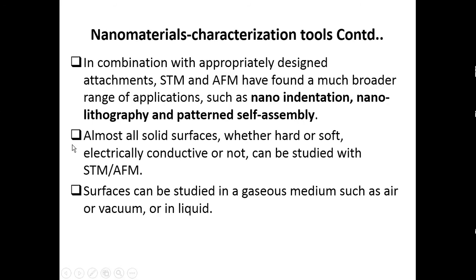Okay, almost all solid surfaces, whether hard or soft, electrically conductive or not, can be studied with scanning tunneling microscope or atomic force microscope, because these two techniques are all done under the scanning probe microscope.